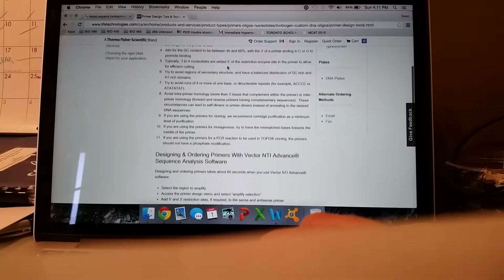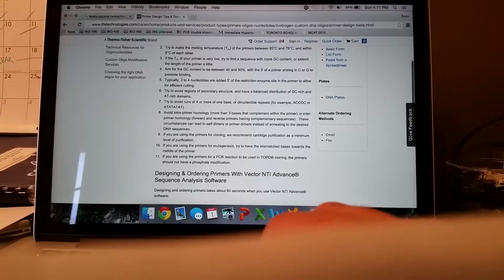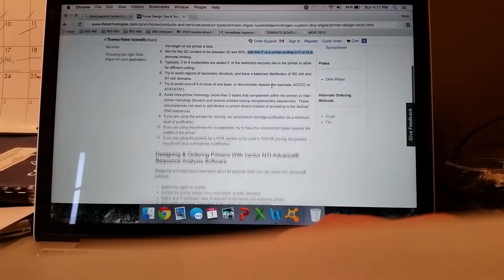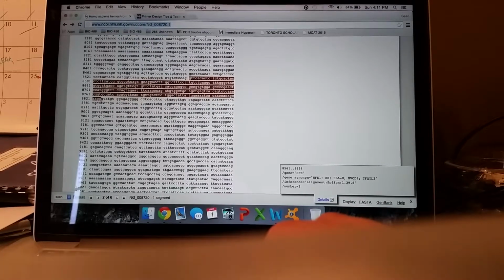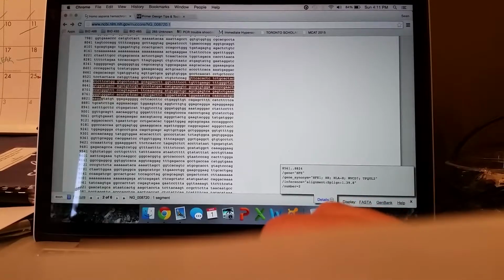You want your GC content. One thing it doesn't say here, but you typically want to end on a C or G. Oh, okay, here. Yeah, you want it to end on a C or G. So you just go back to this and look at the code. And so you're going to run this one backwards. So when you do your primer, it's actually C, C, T, T, G, C, T, etc. You want to end on a C or G.